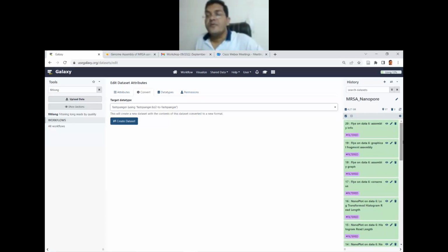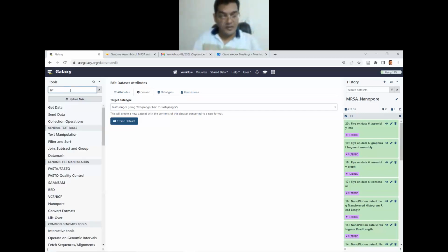Then, of course, if you want to move forward, let's say from Flye, what did we do? We did the Bandage, right? So we can click on Bandage here. Let's see if we can do one live exercise. Bandage.